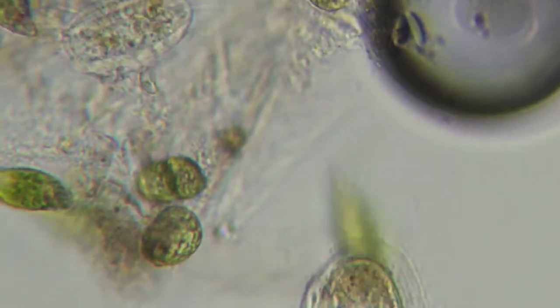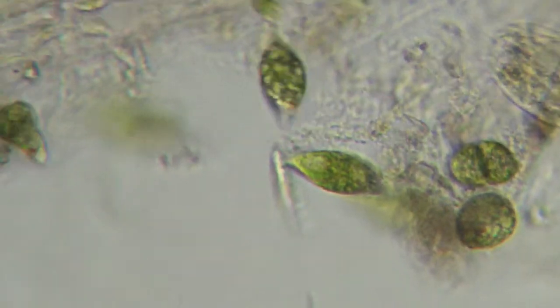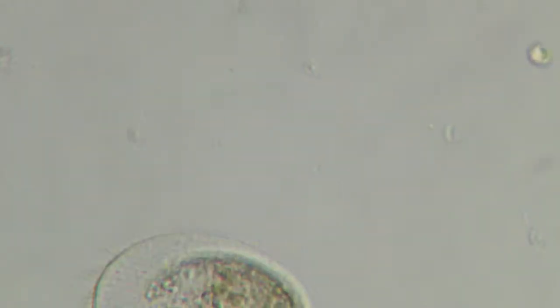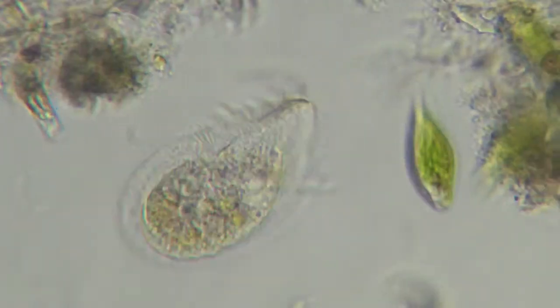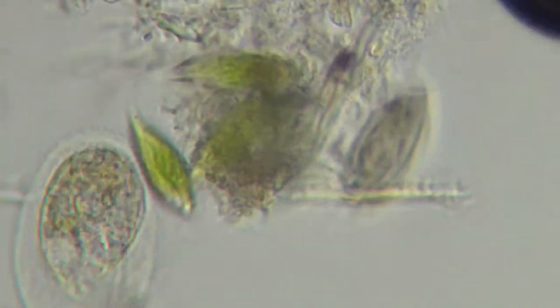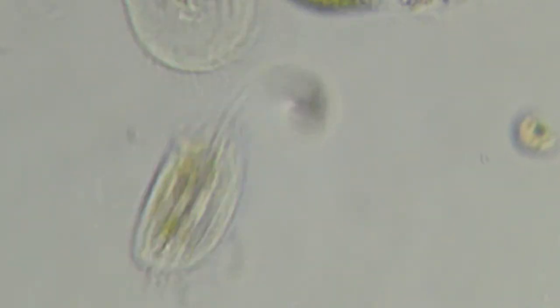And then this guy, this is the flexible one. You see the central mass is much thicker than the margins, the edges. So it's able to push, and you can see a curve right there. It pushes the edge of the cell up and it tapers. It's so bizarre. It just bends. He's trying to climb over stuff. Right next to Euplotes for scale.